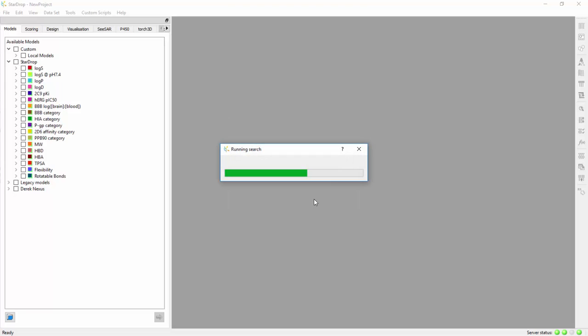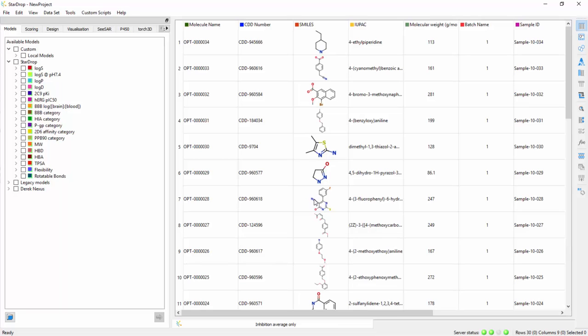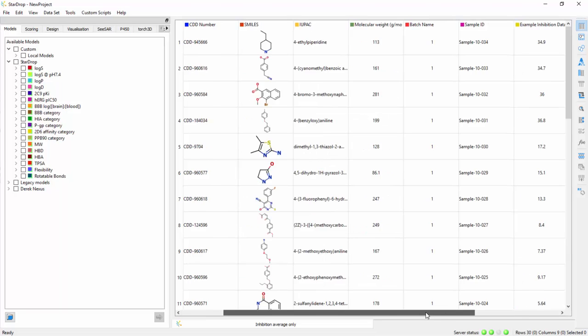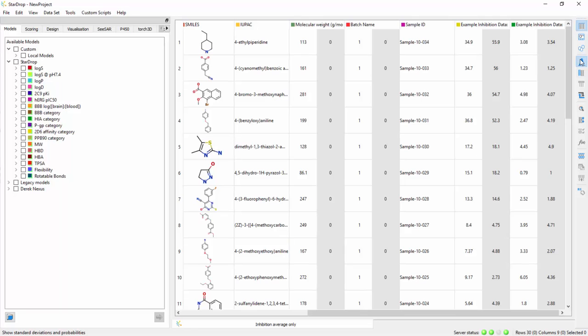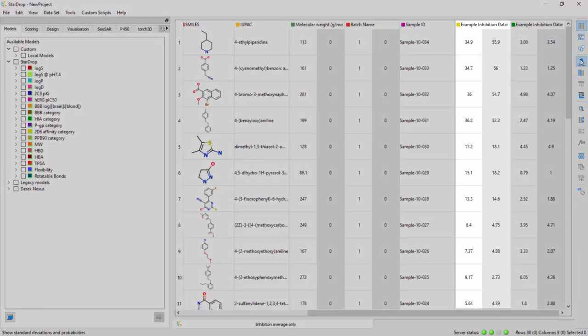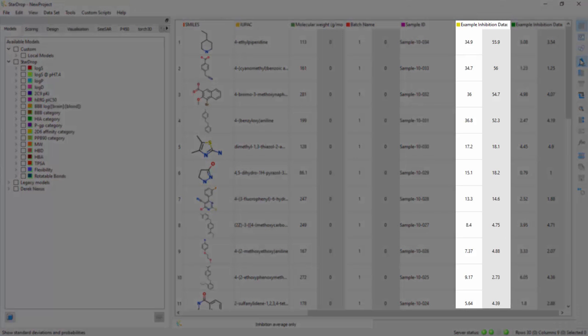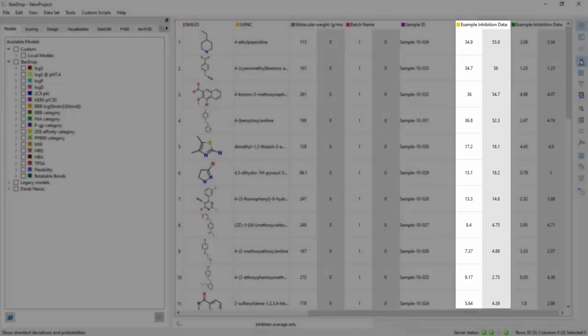Clicking OK will return the data in StarDrop pre-formatted and ready for analysis, visualization, and design. If uncertainties in the data have been stored in CDD Vault, these will automatically be associated with the data in StarDrop.